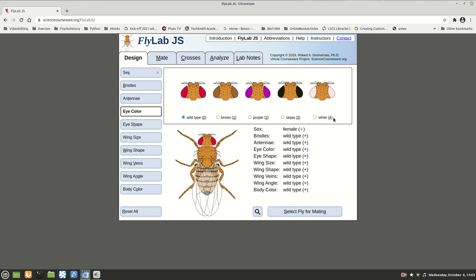We're going to cross these — I don't care what sex they are at this point; in future labs we will. Right now we need to create heterozygotes. So the fly I take from wild type is big W, big W, and the one from white-eyed is little w, little w. We're going to cross these two.